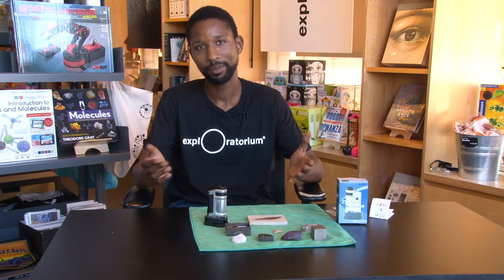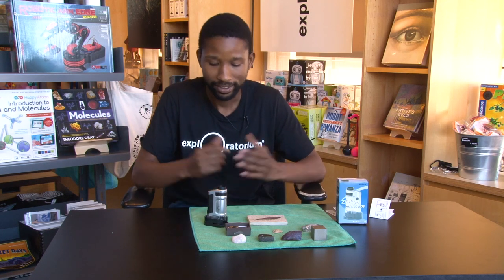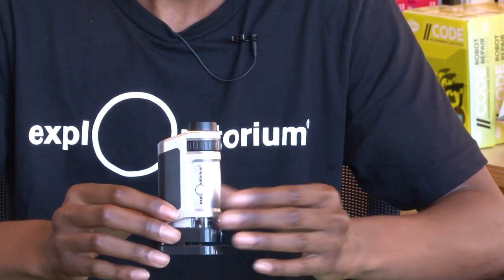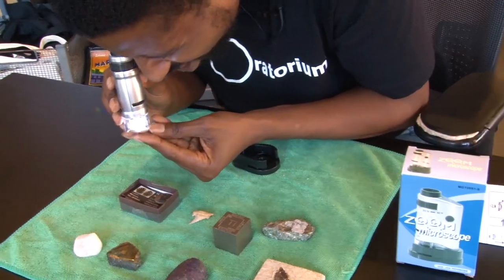Hello everyone, my name is Antoine Simeon here at the Exploratorium, and today I'm going to be showing you the Zoom Pocket Microscope. This pocket microscope is great for all ages and you can actually look at things all around your house, anything in your garage, your backyard.